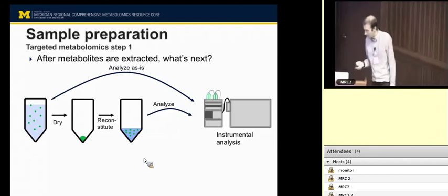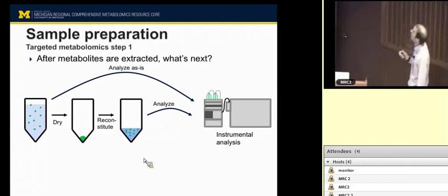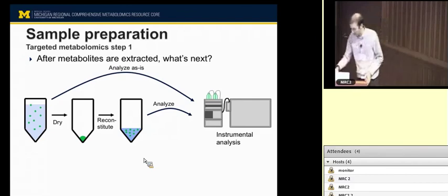All right, and now one more introduction to the presentation. First we'll define the terms. We'll look at different metabolomic strategies, specifically targeted, untargeted, and flux. And then I'll tell you in the course of the talk why it's nice to have these clean, hard, razor-sharp terms, but they don't really apply as much as they used to, as Chuck was alluding to. A lot of the time there's some blurring. Still, there are some cases where the terms are useful to know.